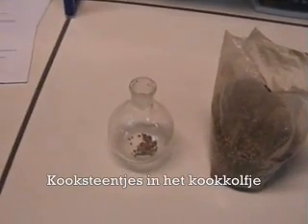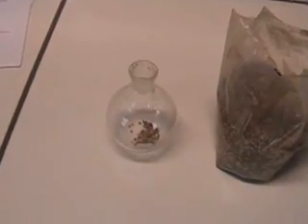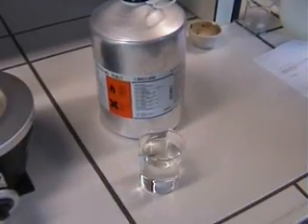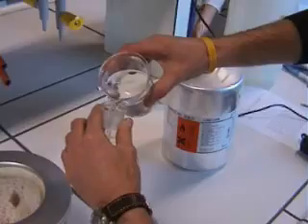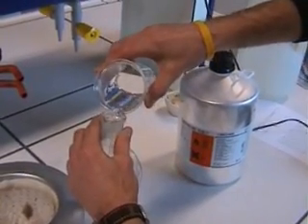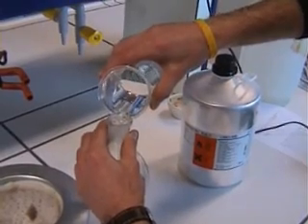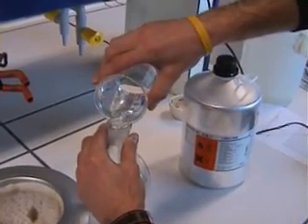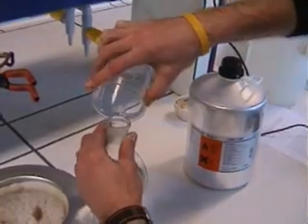In het kookkolfje brengen we enkele kooksteentjes. Bij een extractie moet men steeds gebruik maken van een oplosmiddel. In dit geval is dat ether. Zorg er steeds voor dat de hoeveelheid oplosmiddel meer is dan de inhoud van het soxletapparaat. We brengen de ether in het kookkolfje en plaatsen deze in de verwarmingsmantel.